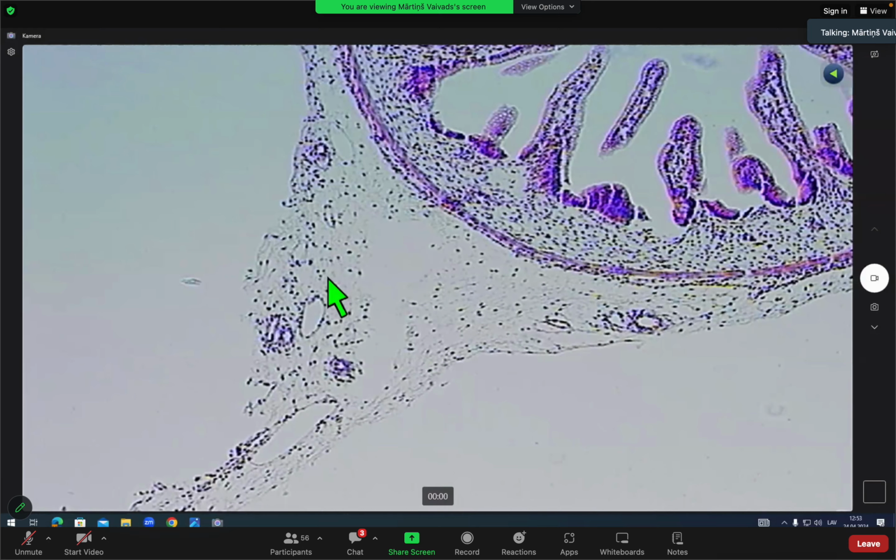So developing mesenterium, that's specific for some slides. It's not the typical structure, but when you have a question, what is this connective tissue connected to the intestine? That's the mesenterium. So developing mesenterium, you can see. In general, that would be it.